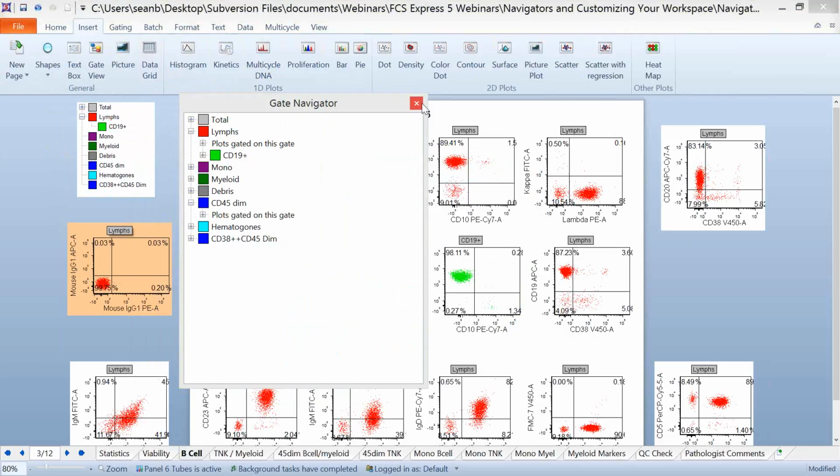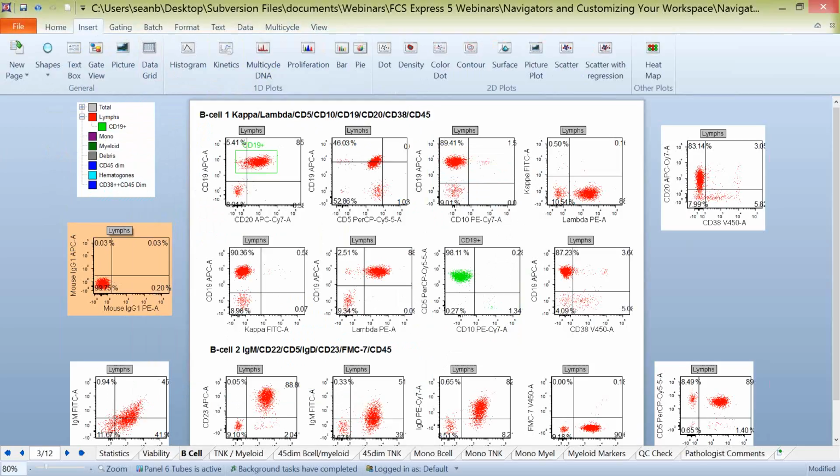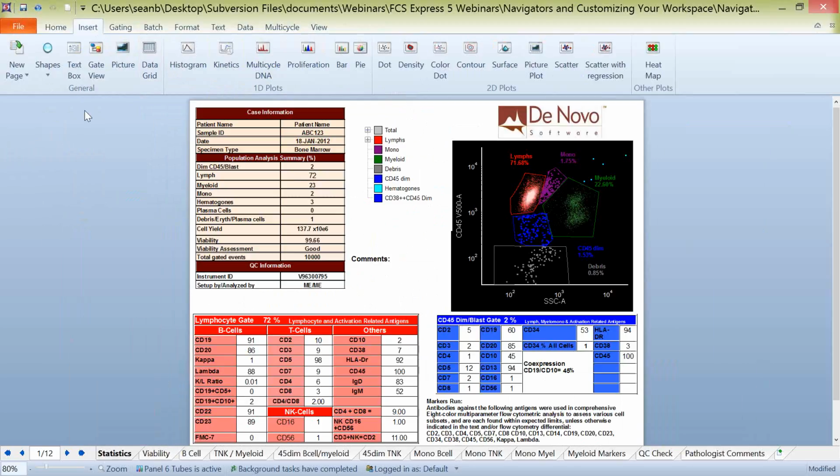So we can also do some other unique things in FCS Express for quickly accessing different features and functionalities within the software. A lot of this is controlled through what we call the Quick Access Toolbar. And you can see that this is the Quick Access Toolbar up here. By default, we show a few different icons in here, the Save button, the Undo, and the Redo button.